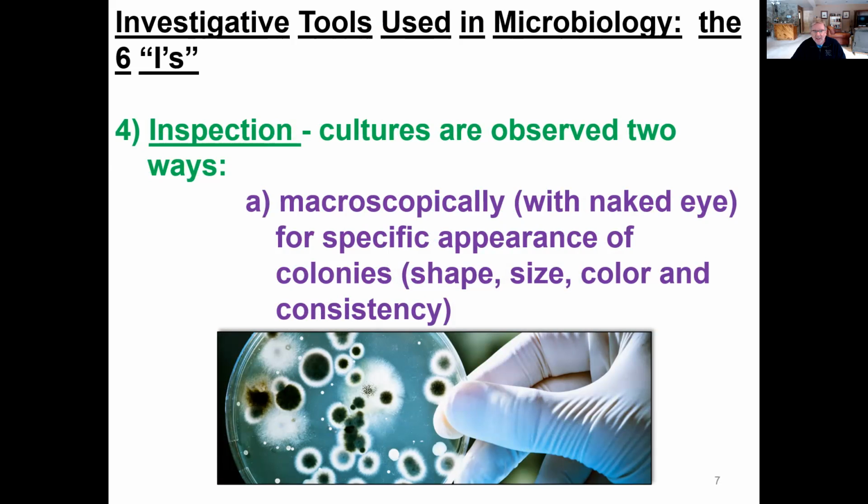And you can see from this plate that we've got a variety of different colors and different sort of textures, if you will, to the margins of these colonies. These actually look somewhat like fungi. Kind of hard to tell exactly what they are. Could be bacteria too.